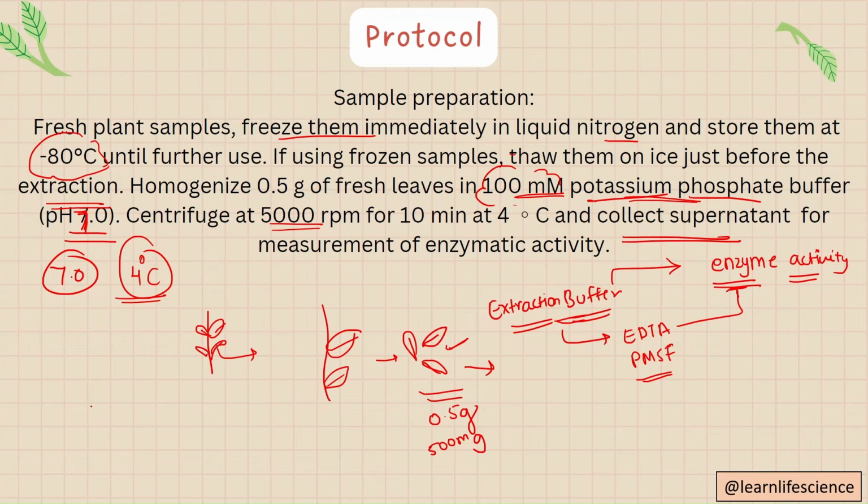Okay. Now, you are done with the sample preparation. This sample which you have prepared, for example, one will be the control, in which there is leaf extract from a normal plant, and the other one will be treated, in which you have subjected the plants to stress condition or abiotic stress. Similarly, you can take your different samples, like if you are treating it with your own treatment like bioformulations, then you can consider those too.